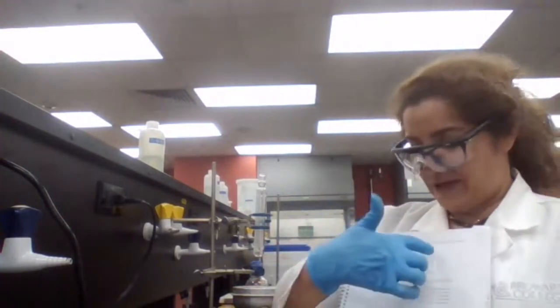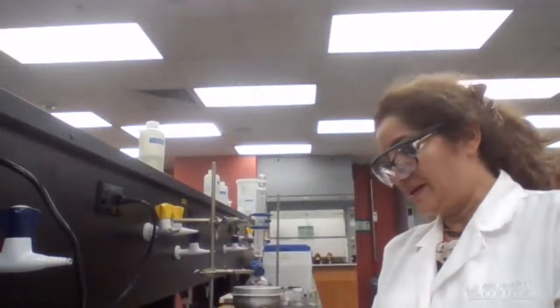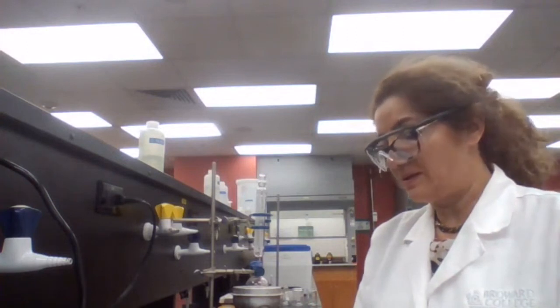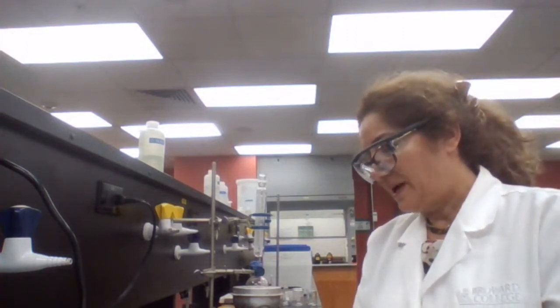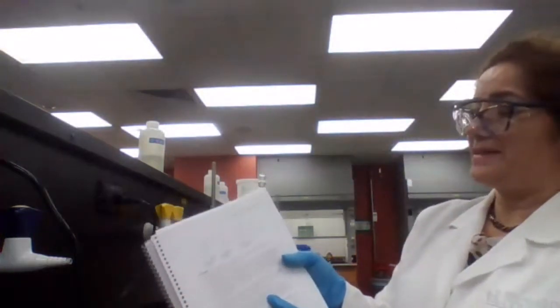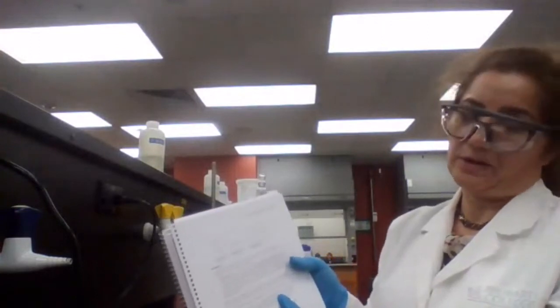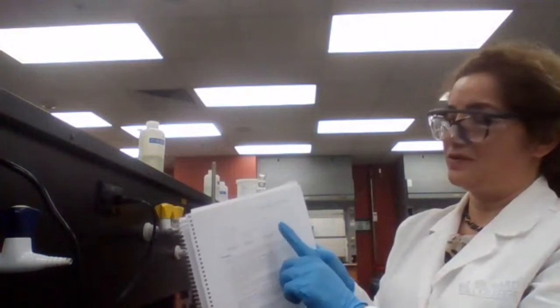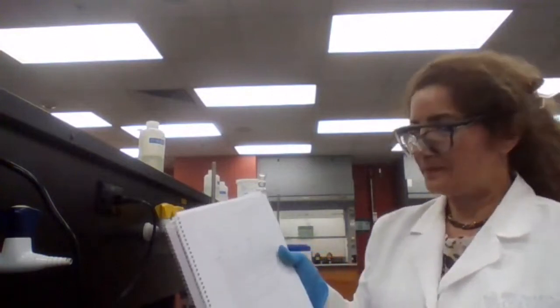Then you have to have a purification technique. What is the purification technique in this experiment? You could use extraction, you could use distillation, or if you have a solid compound, you could use recrystallization. And in this case, you are using extraction, right? Because you are using butyl methyl ether to extract the product. So after your reaction is done, you would do extraction for purification of the crude product.